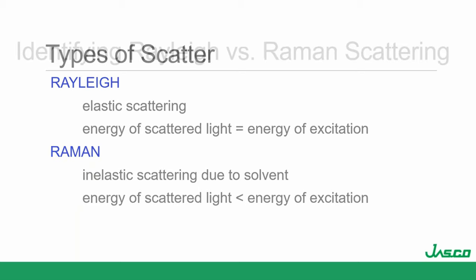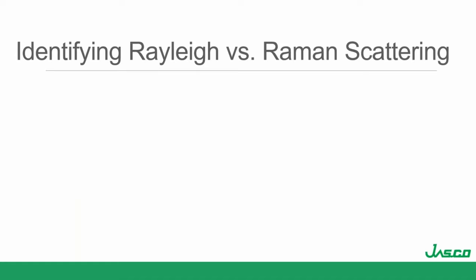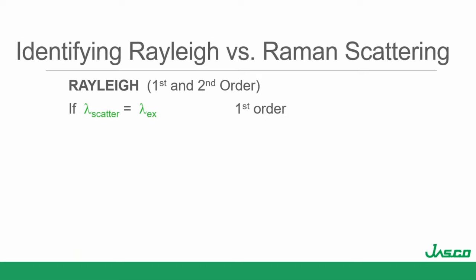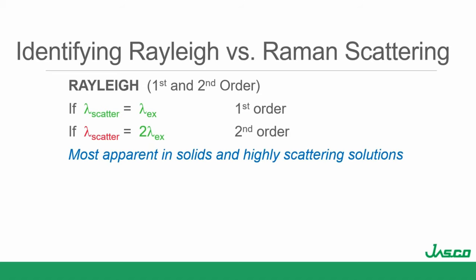The solvent is present in the greatest amount, and even though Raman is a very weak effect, it shows itself and can interfere in fluorescence — it shows up at energies of scattered light at longer wavelengths. How do we tell the difference between Rayleigh and Raman? Rayleigh can be first or second order scatter. If the scattered peak is at the excitation wavelength, it's first order. If we get a band at double the excitation wavelength, that's second order Rayleigh scatter — apparent in most solids and highly scattering solutions.